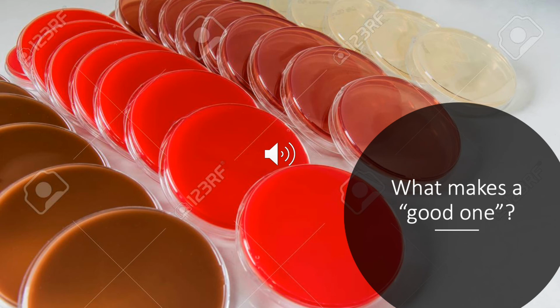It is important that you have the correct basal ingredients along with the correct special nutrient that you add to your enriched media. You must ensure the proper steps are carried out when preparing your enriched media and adding the special nutrient. For example, we previously talked about the chocolate agar and how we must heat the red blood cells prior to adding them to lyse them, as this will allow for the addition of hemoglobin to the medium, and this is how you will achieve your desired results.